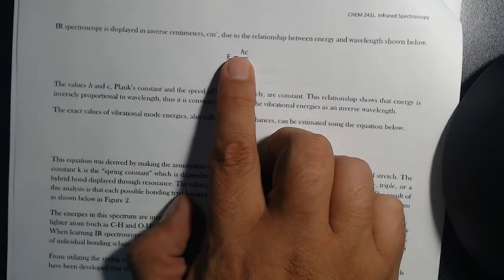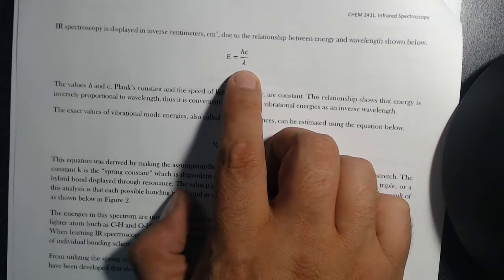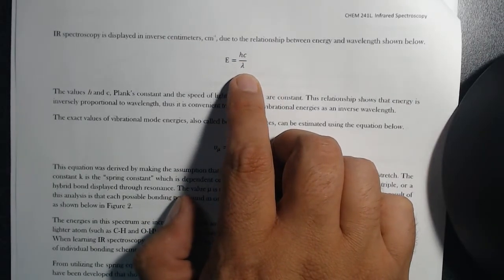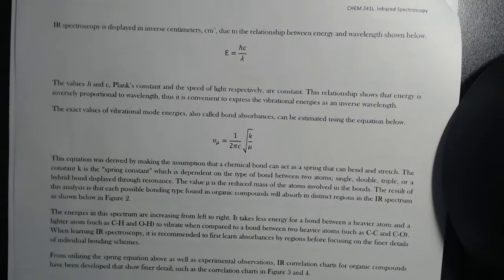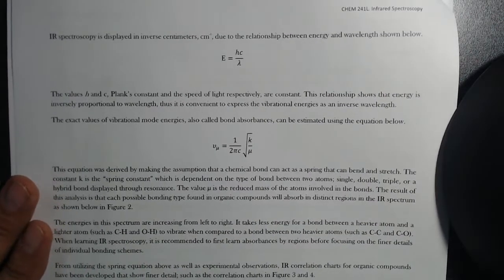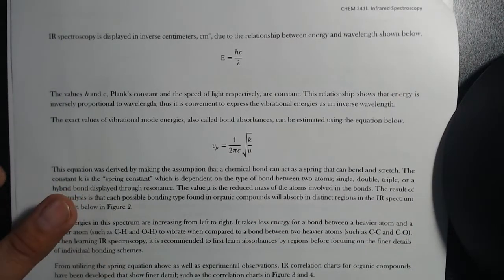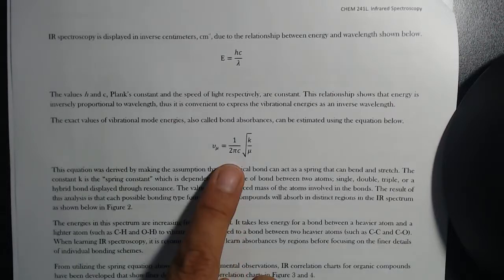You remember h and c, those are both constants, right? So the only thing changing here is 1 over wavelength, so it makes sense to report these values as inverse centimeters. There actually are modes on the instrument where you can toggle it to show wavelengths and nanometers, other units that you're familiar with.